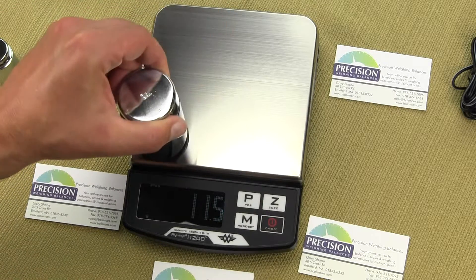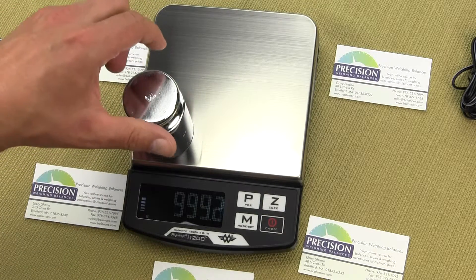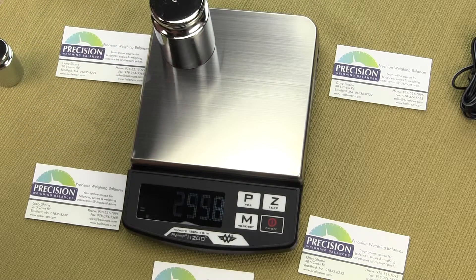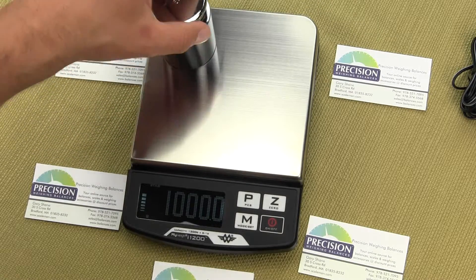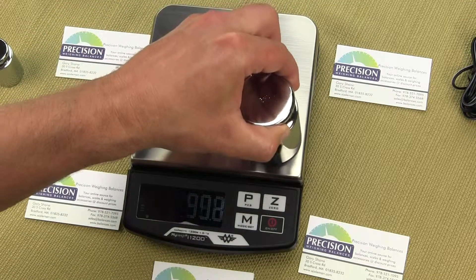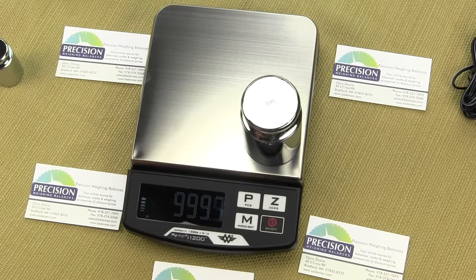Now I want to show you the eccentric load test. If I place the calibration weight in the corners of the platform, you'll see it is very precise.